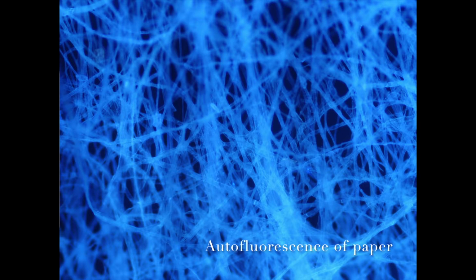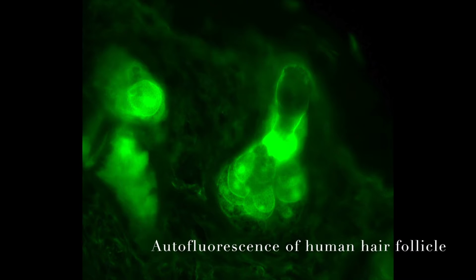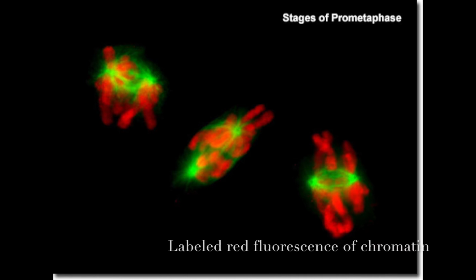Kohler was able to first report autofluorescence of tissues using the UV microscope. At first, he reported the fluorescence to be a nuisance because it reduced the specimen's contrast. He later realized the practical applications of this fluorescence when his colleague Henry Friedrich Wilhelm Siedentopf was able to observe the unstained ultraviolet image of chromatin in the cell nucleus. Improvements to fluorescence microscopy were needed to make this a practical technique for imaging.